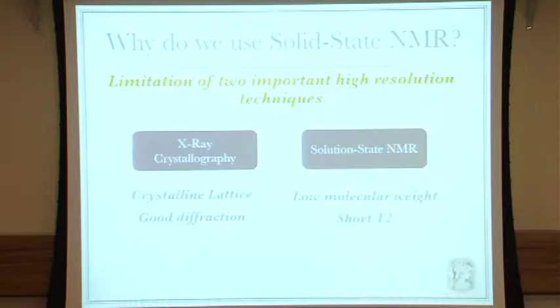But why do we use solid-state NMR? We have solution-state NMR. The reason for that, in principle, is the limitation. Of course, we can get several results from solution NMR, but the number of people working with solid state increased because of the limitation of two important high-resolution techniques.